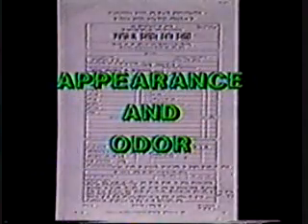It also addresses questions such as, what does the chemical smell like? Will it burn? What will happen if it contacts the skin or gets in your eyes? How about long-term health effects of exposure to the substance? Does it react with other elements? What do you do if a spill or leak occurs? What kind of protection information or special precautions are necessary?